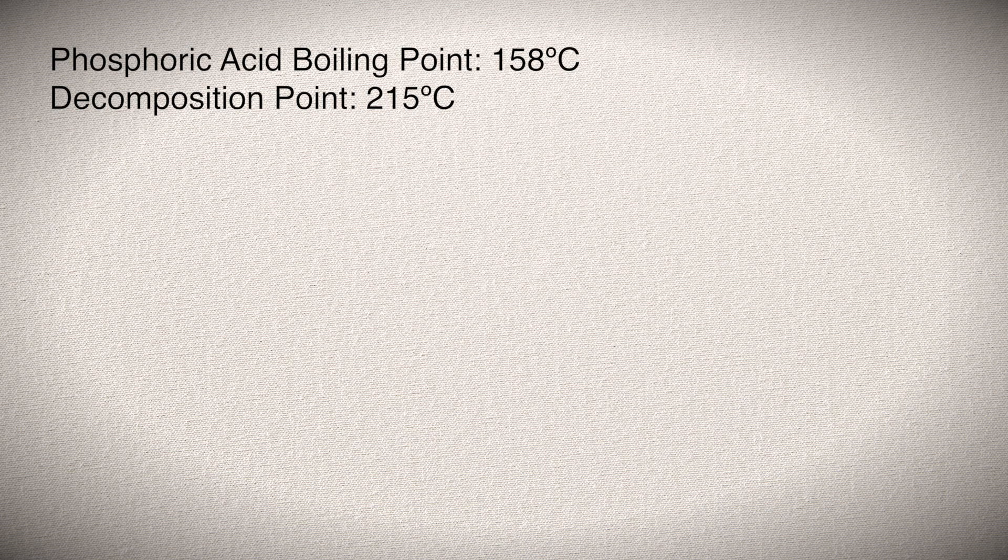Also, the boiling point of phosphoric acid is 158 degrees Celsius, which is a pretty significant temperature to retain throughout the first bits of glassware in a distillation apparatus. Once the temperature exceeds 215°C, which I allowed it to in my first run, the phosphoric acid can decompose or polymerize.